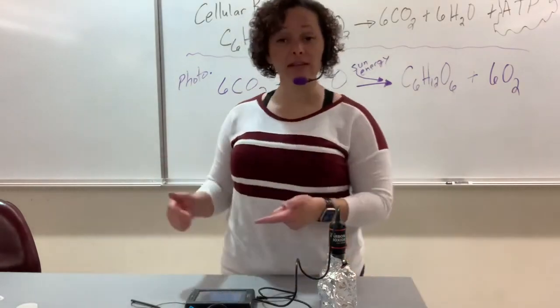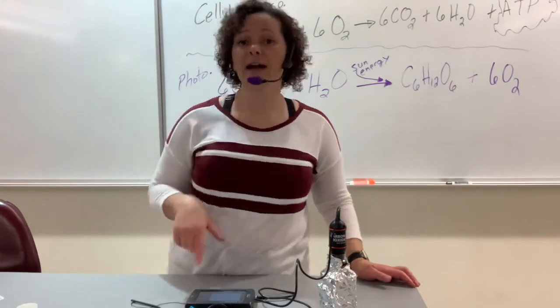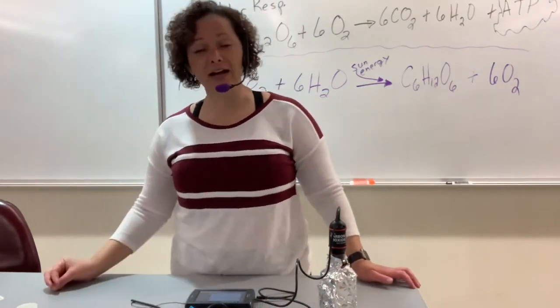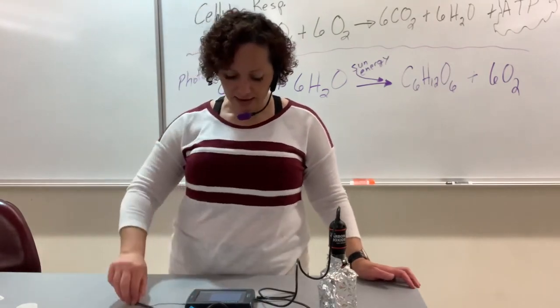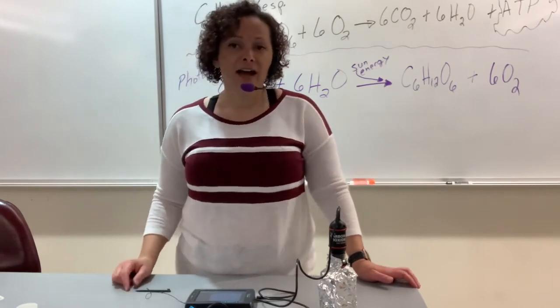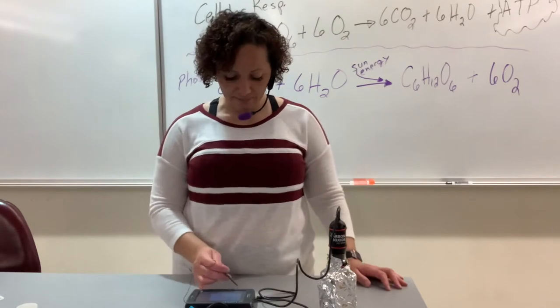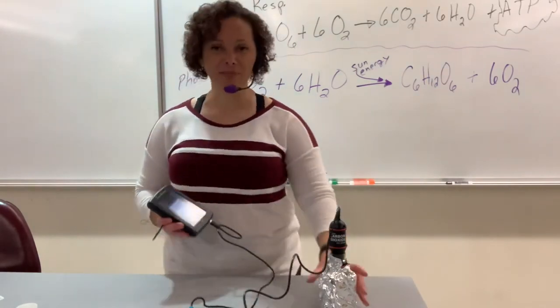That is what the machine is doing. It's doing that for you, that way you don't have to do that. But you will have to use that in order to calculate that next step. And just hold on to that, I'll explain that. So don't hit the stop button, but at the same thing, I don't want you to sit here and stare at me for 3 minutes, so I'm going to hit the stop button just so I can show you what's next. Oh, wow. Isn't that beautiful?